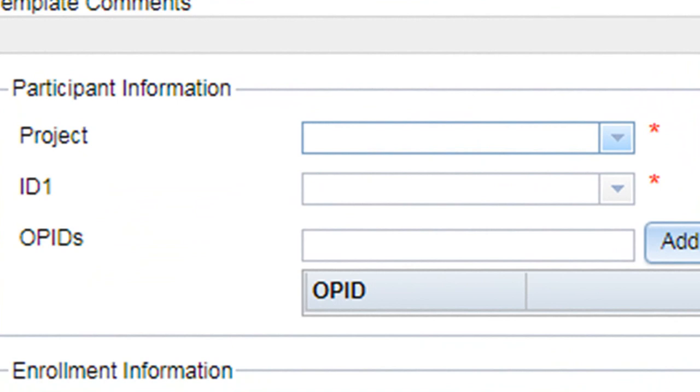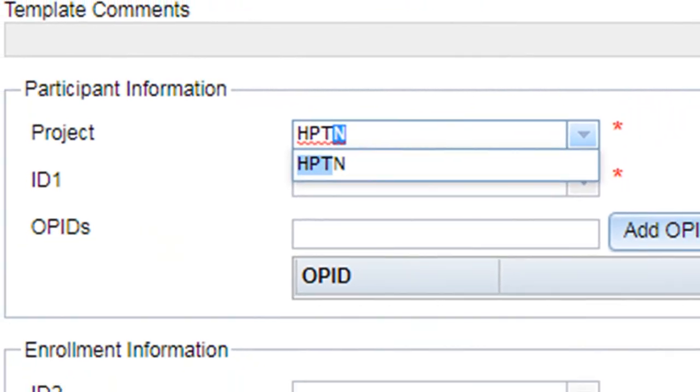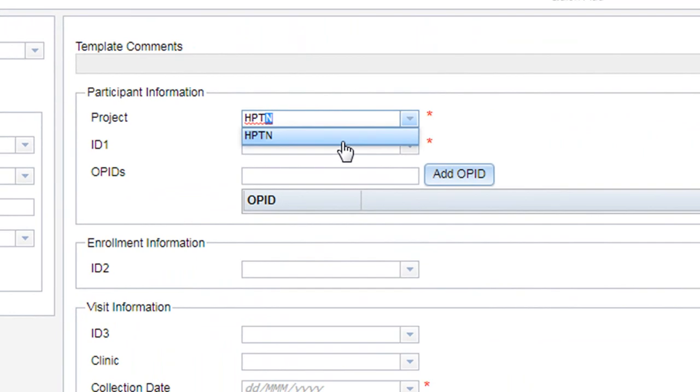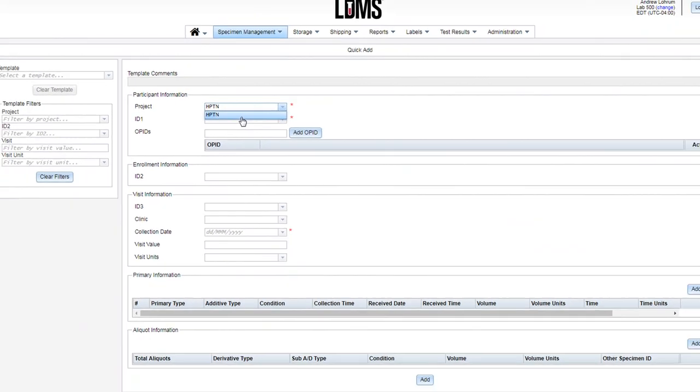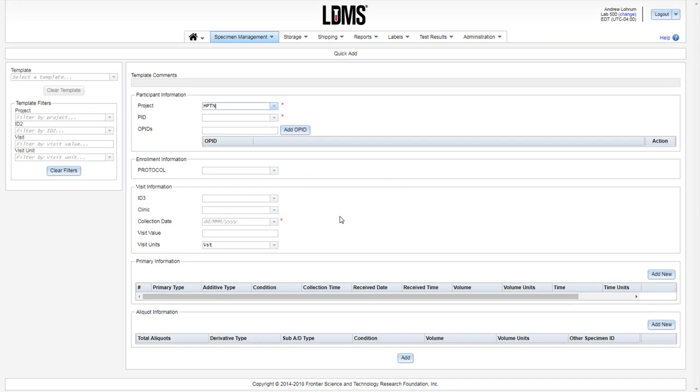Type in your project and select. Once the project is chosen, you're asked if you wish to load the default visit values for that project, PID, and protocol. Choose Yes. And for this project, note that the visit unit has auto-populated.